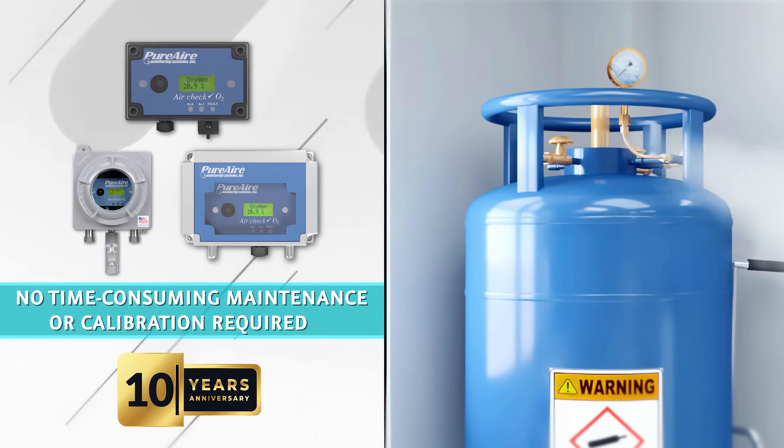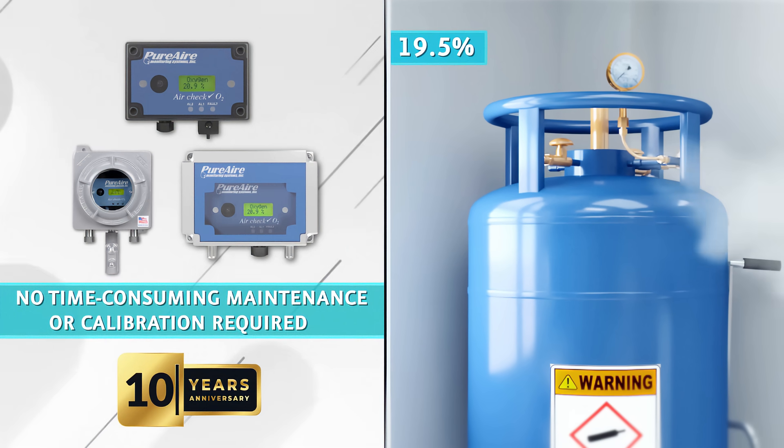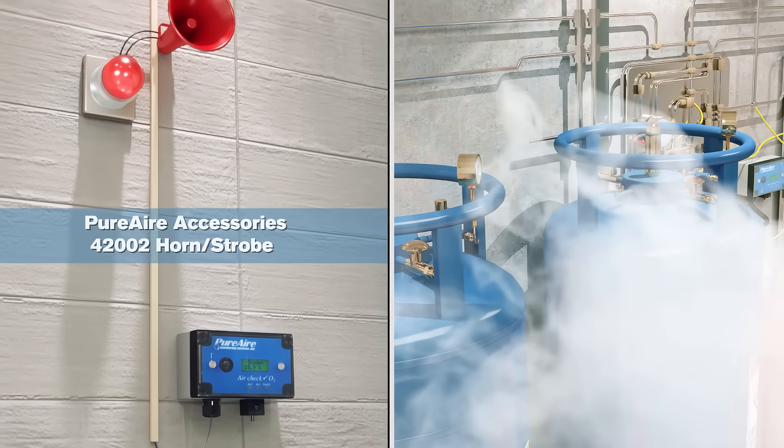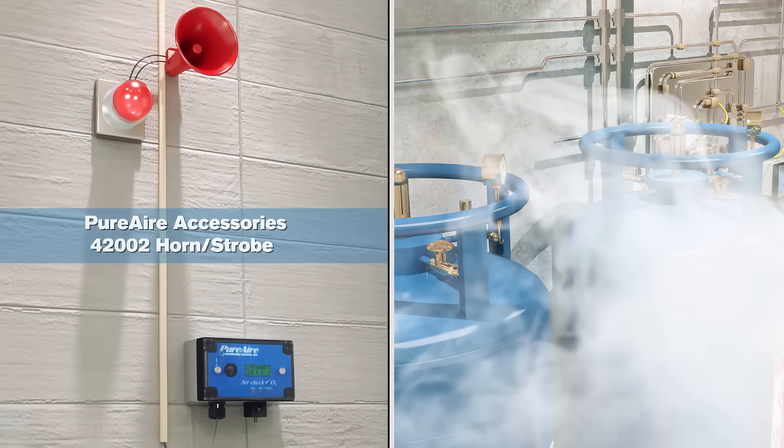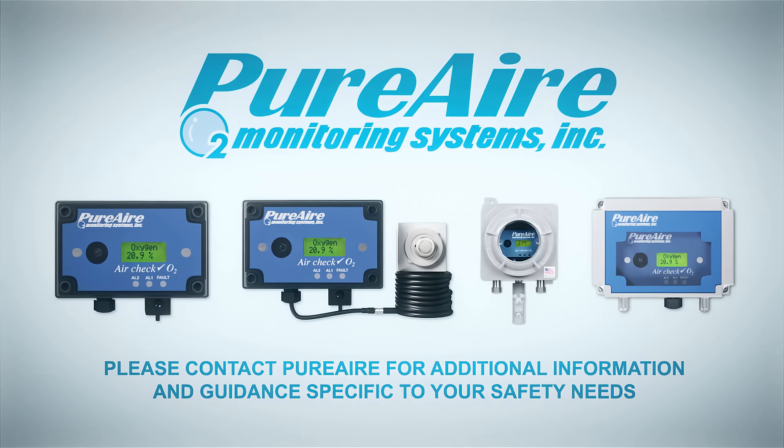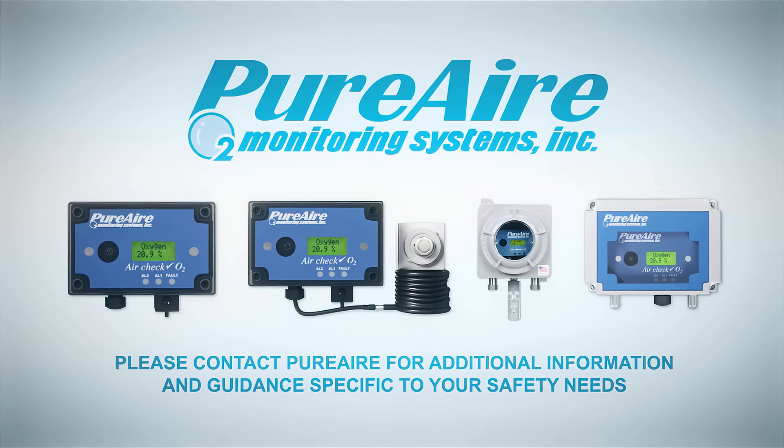In the event of a gas leak and a drop in oxygen to 19.5%, the monitor will set off an alarm, complete with horns and flashing lights, alerting employees to evacuate the affected area. Please contact PureAir for additional information and guidance specific to your safety needs.